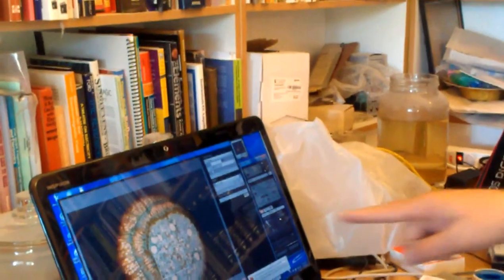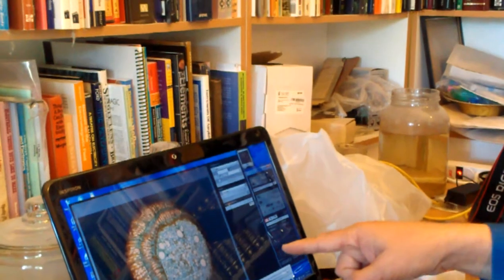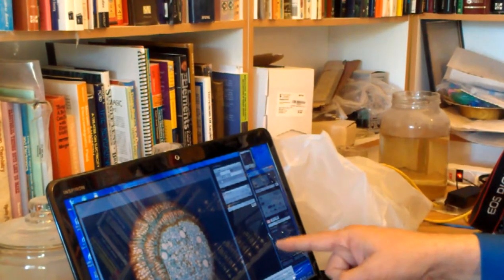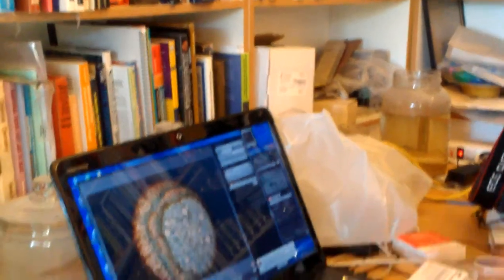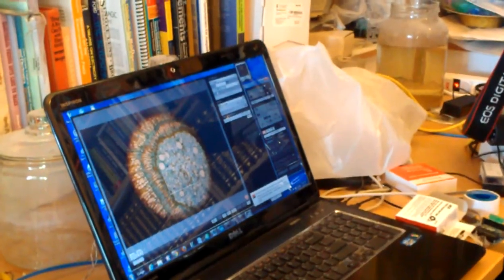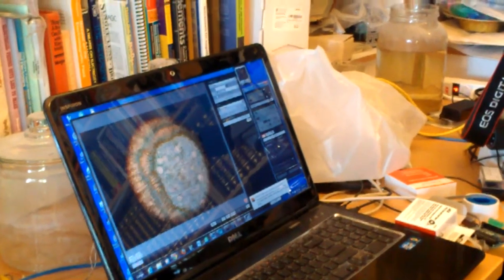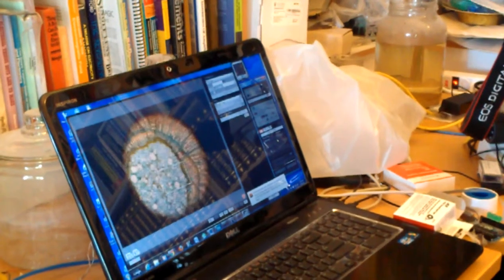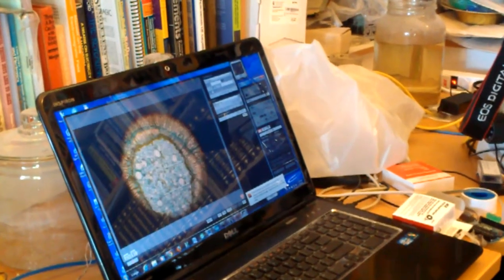The camera is showing us on the computer screen over here, and I can move things around so that you can see that it's live.